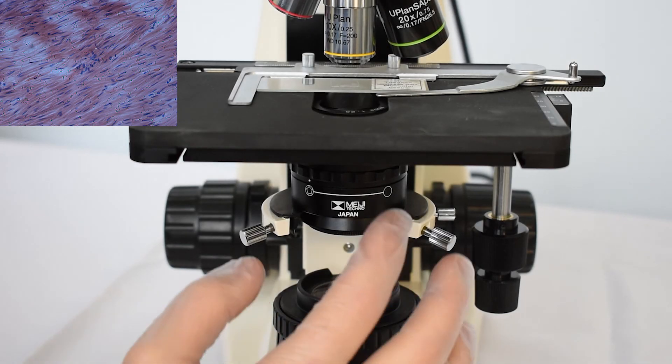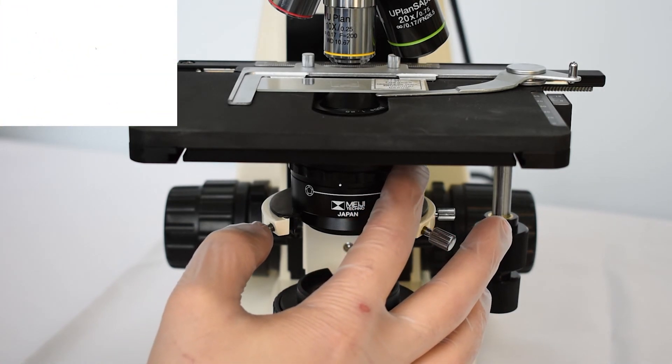Next, the condenser diaphragm should be opened. Finally, you can adjust the light intensity that is comfortable for the sample study.